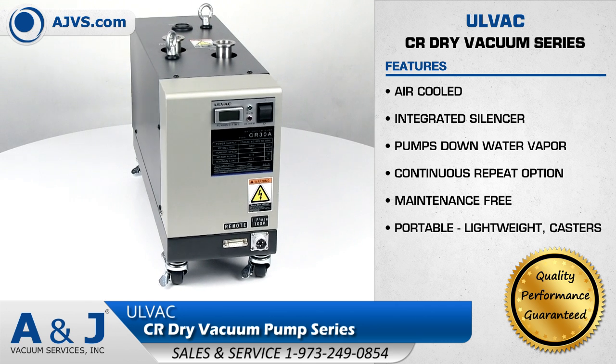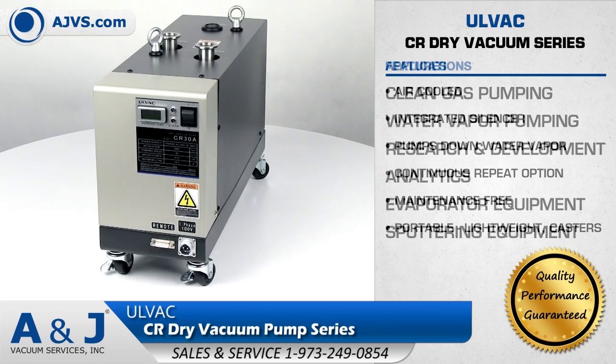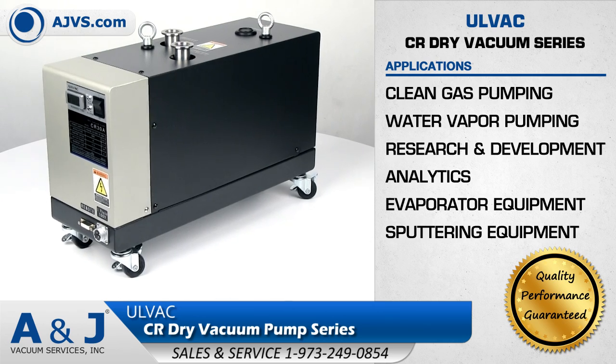The Olvac CR Dry Vacuum Pump series is a highly reliable and low-maintenance high vacuum solution for applications in research and development, analytics, and evaporator and sputtering equipment.